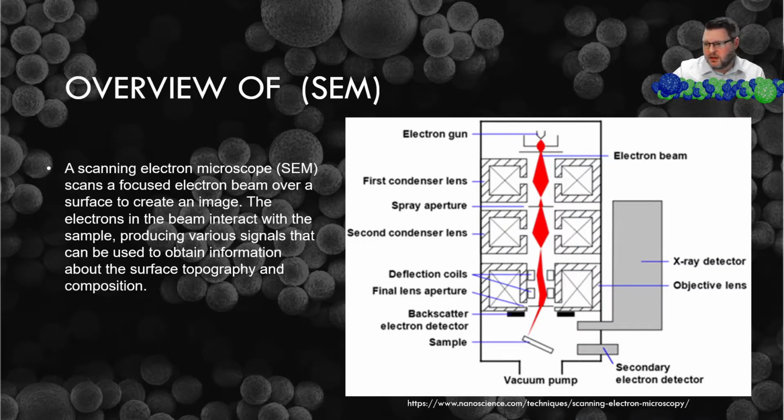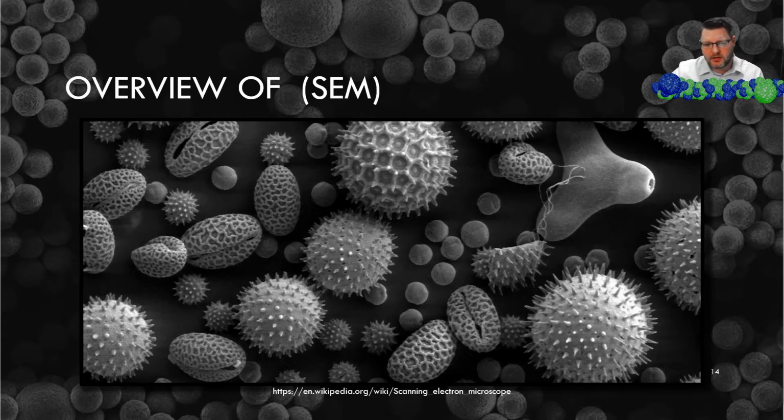So, just a little image of a SEM. There is an image that I found of SEM. It's pretty interesting there, the extreme details.